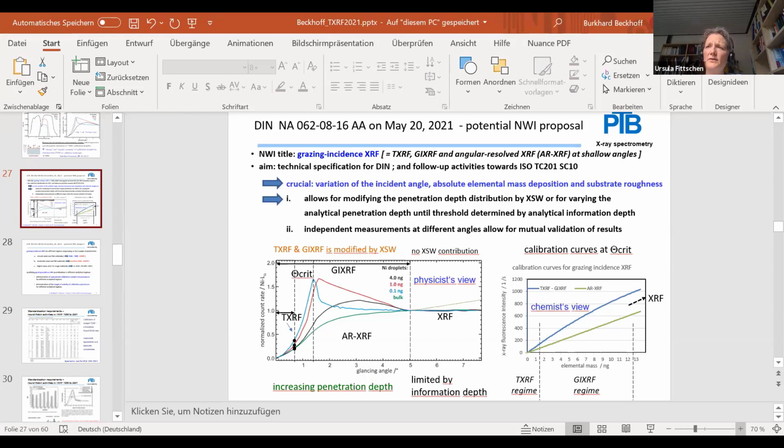So I think you said it, but what would be rough and what would be like smooth? So what would be the rough? So for hard X-rays, the limit is 1 nanometer, more or less, and for soft X-rays, 5 nanometer. Okay. So better than 1 is smooth in the hard X-ray range.